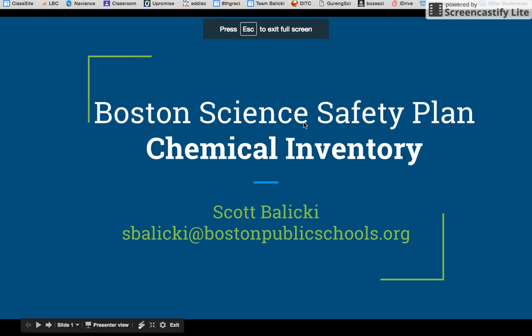Hello, this is Scott Balicki from Boston Latin School, and I'm going to give you a quick tour of Chemventory, the online chemical inventory program from Flynn Scientific that Boston Public Schools Science supports.